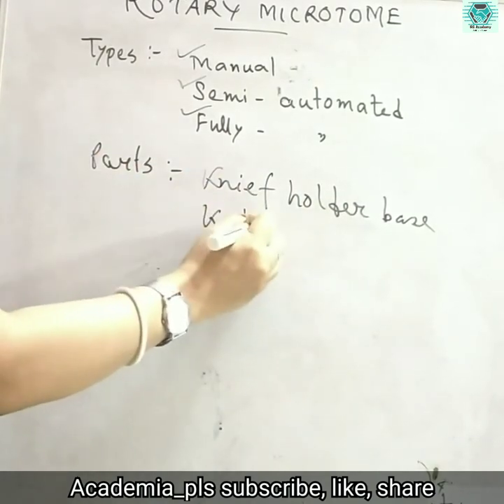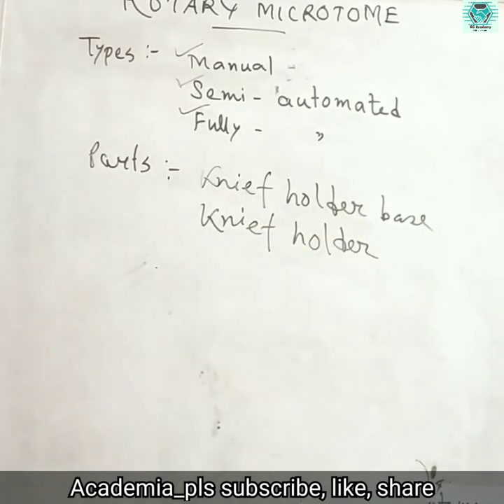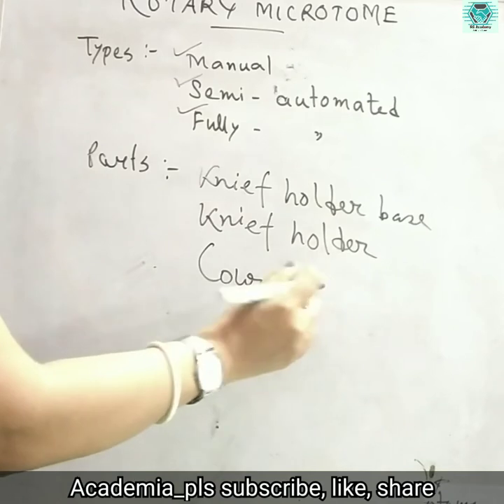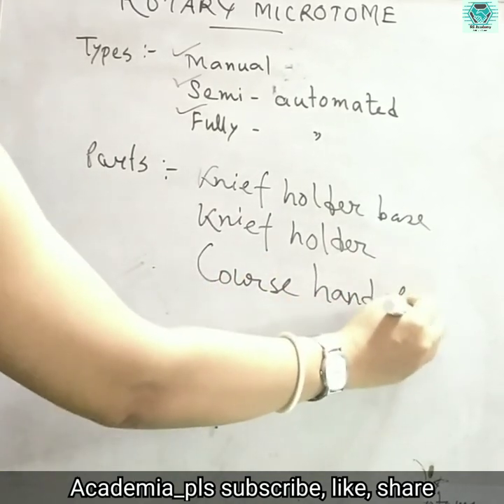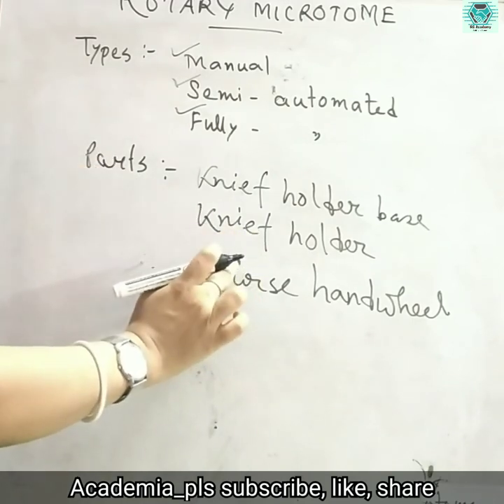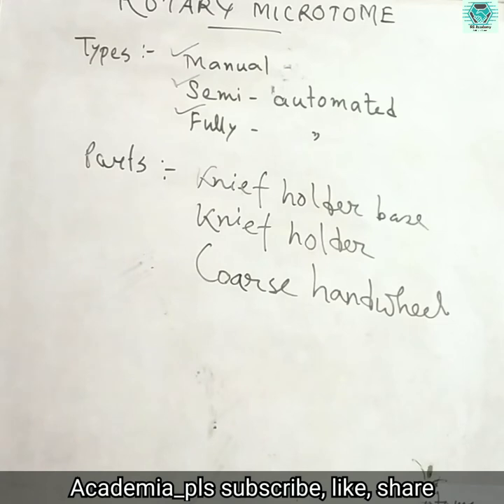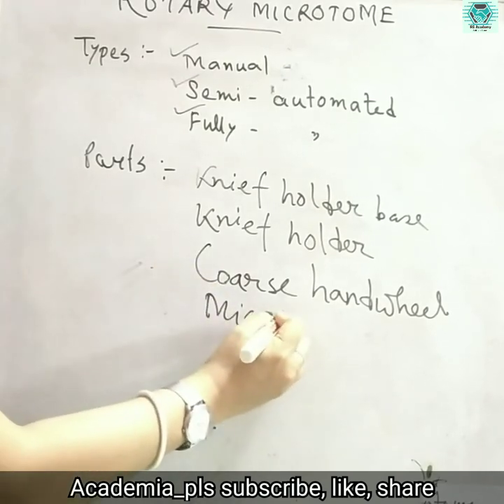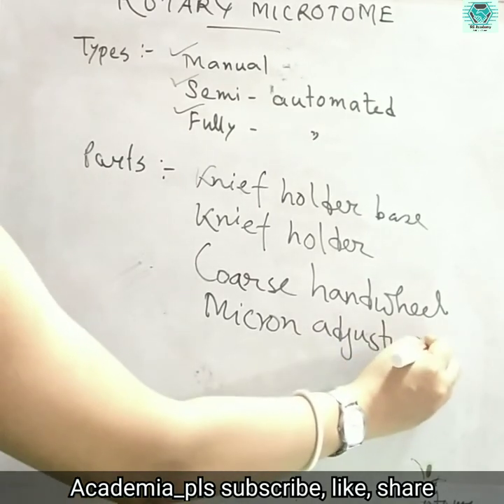Then the coarse hand wheel. Then the micron adjustment.